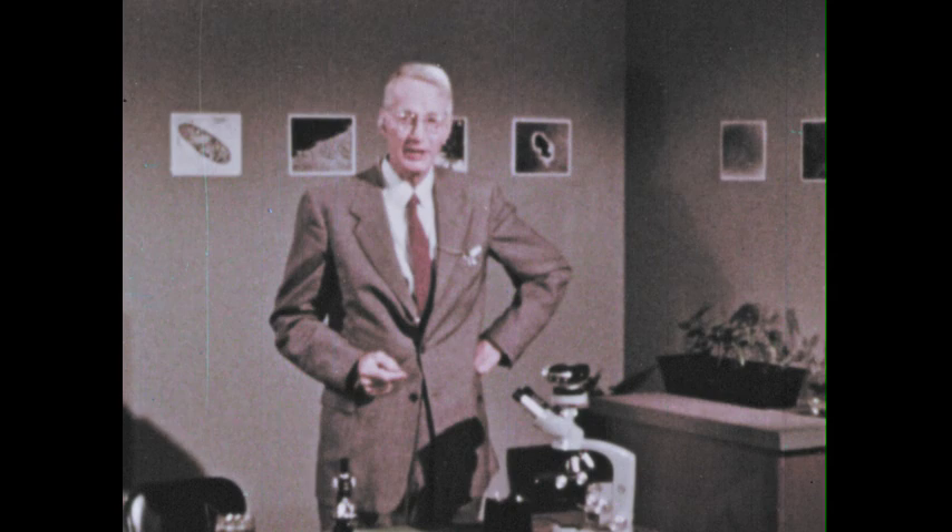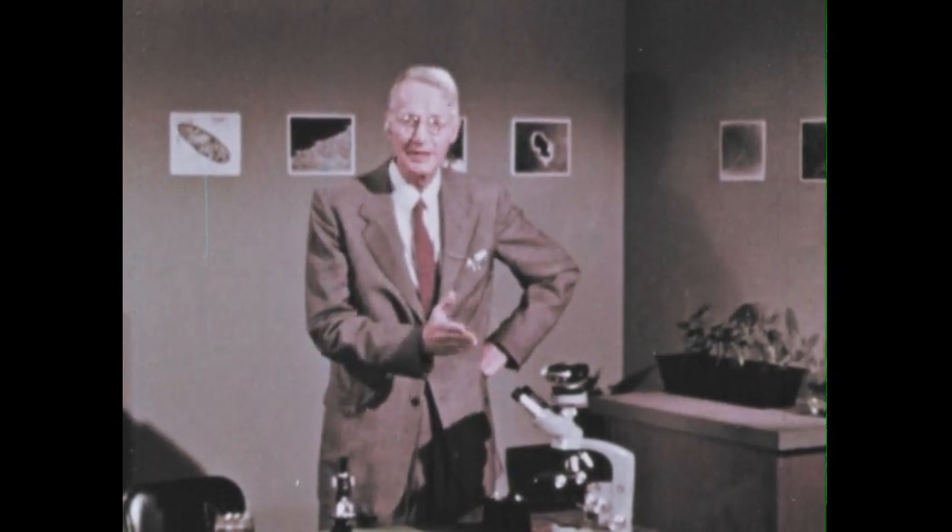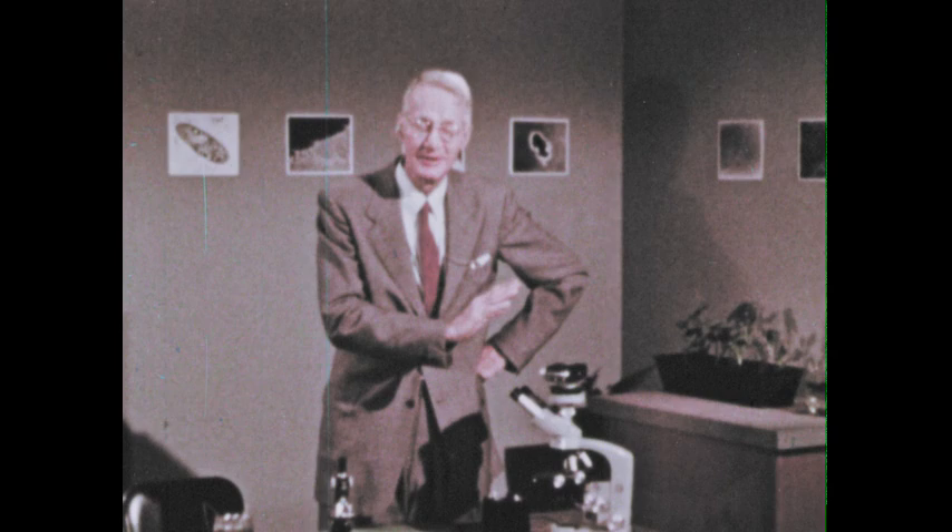With that better microscope, and all the perfect adjustment for lighting and things of that sort, you could see more, couldn't you? You could see more clearly. You could understand better. And you could answer some of the questions that had come up in your mind. But you also realize that you've been seeing these things before with your own microscope. And now that you've seen them here so much better, you're going to go back. And using your own microscope, you'll be able to see much more. So you're going to study again — paramecium and euglena and amoeba. And in your study of these, and the watching you now will do, I wish you the best of luck.